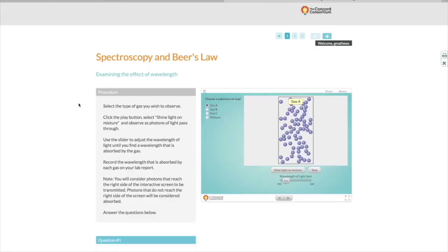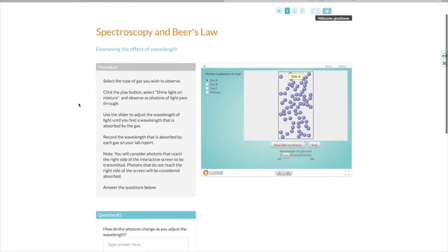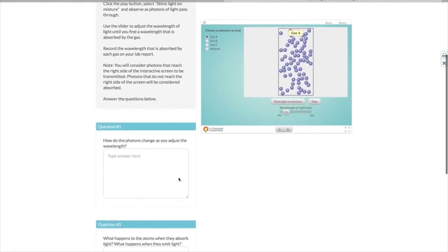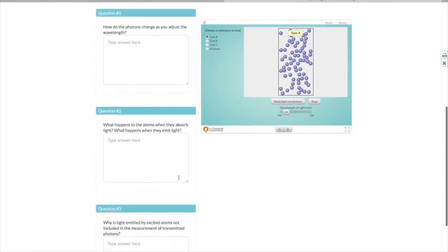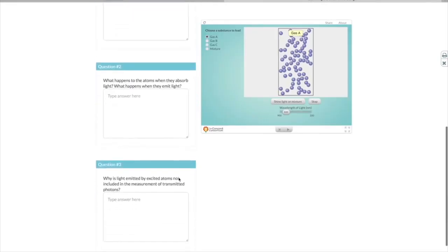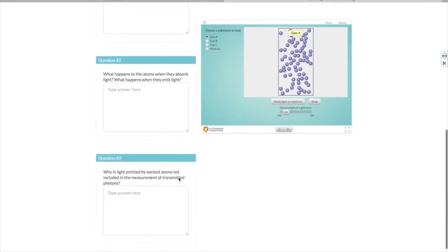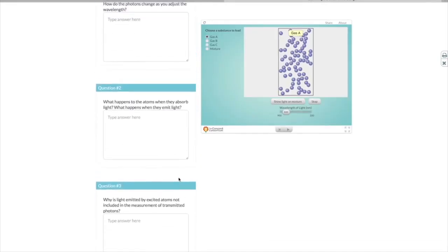Notice on the left side of the page you'll have instructions, and the right side will have a simulator. If you just follow the instructions on the left, it'll help you use the simulation. If you scroll down, you'll see that there are questions on the left that you need to answer as you're doing this activity. Make sure that you talk with your lab partner about them, because you'll turn in one report for both of you.